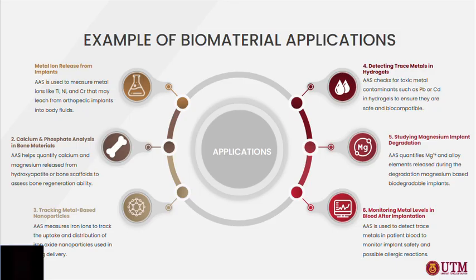Finally, monitoring metal levels in the patient's blood after implantation. Overall, these examples show how analytical techniques support safe and effective biomaterials.